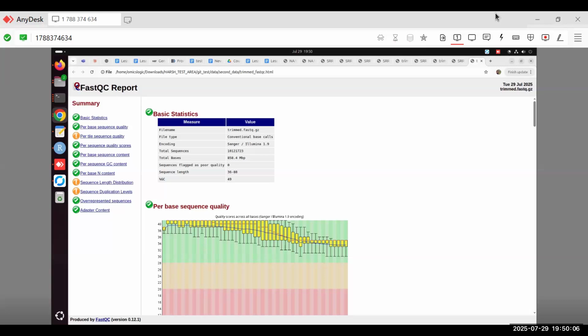Why I'm asking is, after getting this count matrix, we always get confused about how much p-value we can use. P-value is fixed. We cannot change it. It has to be less than 0.05 to be significant. That is a statistical parameter. What we can work with is log FC.